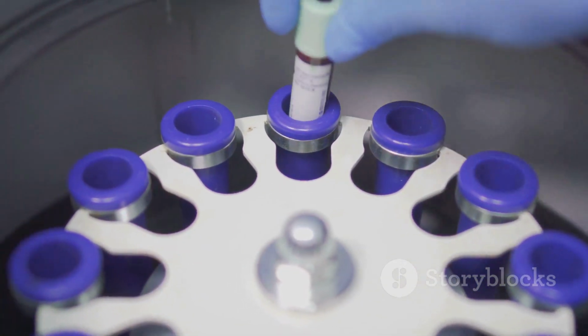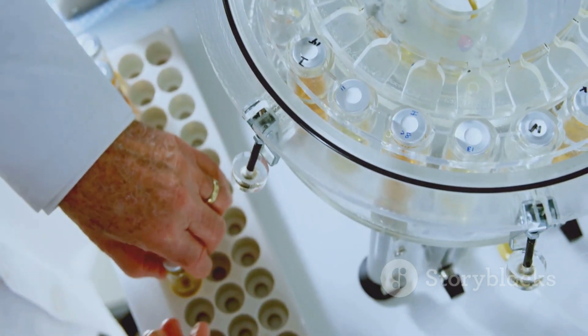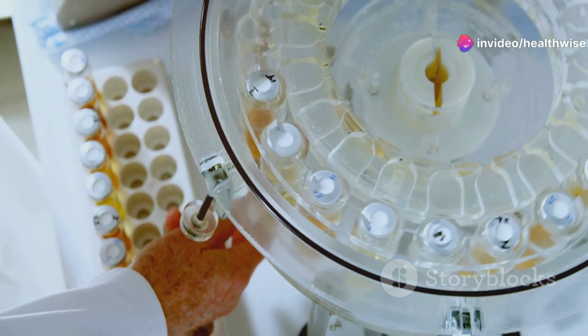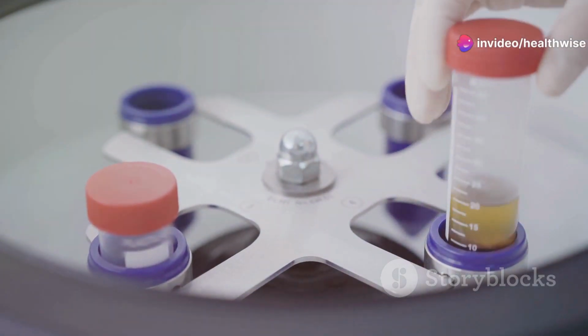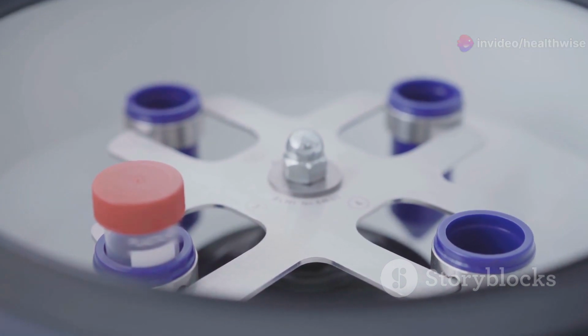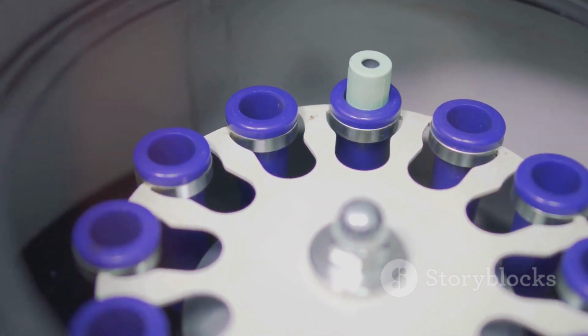A centrifuge just speeds up this process by creating a strong centrifugal force that pulls the denser particles outward, away from the center of rotation. The result? Beautifully separated layers of different substances. This separation process is incredibly useful in countless applications.